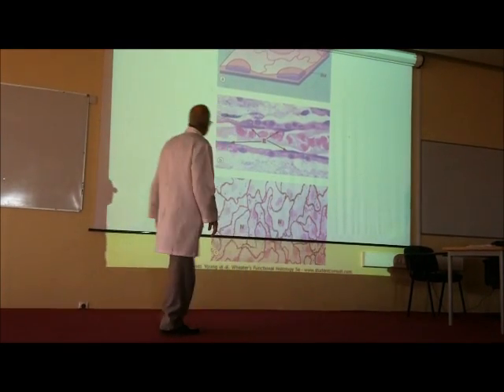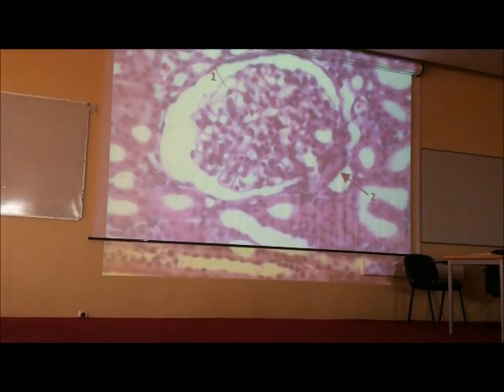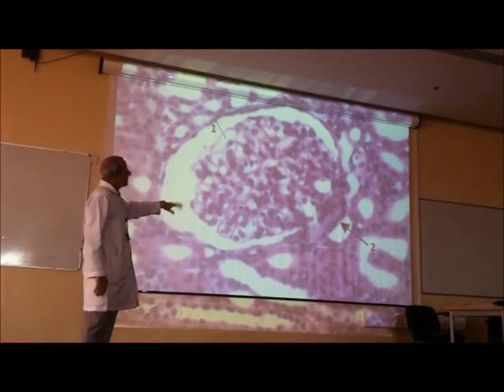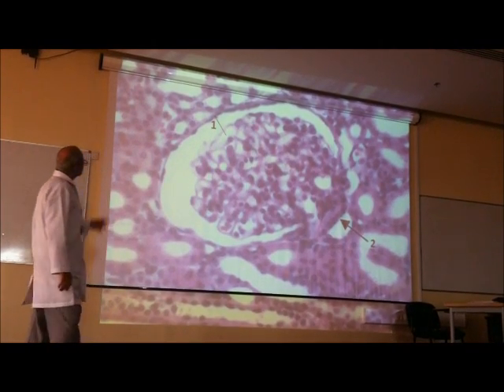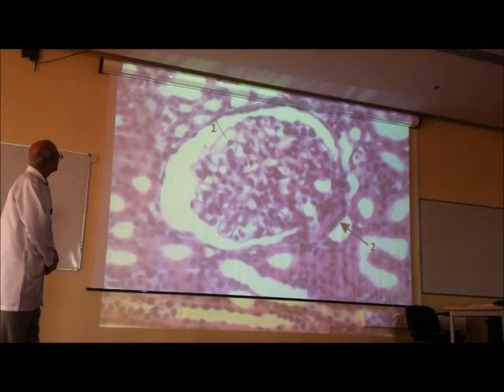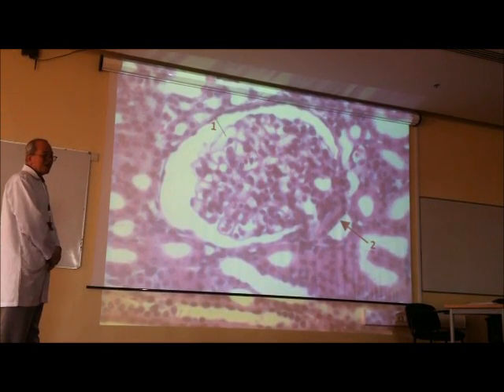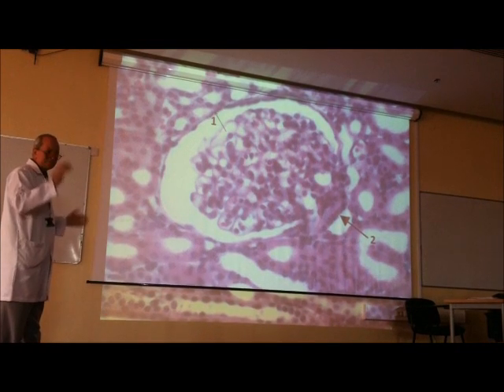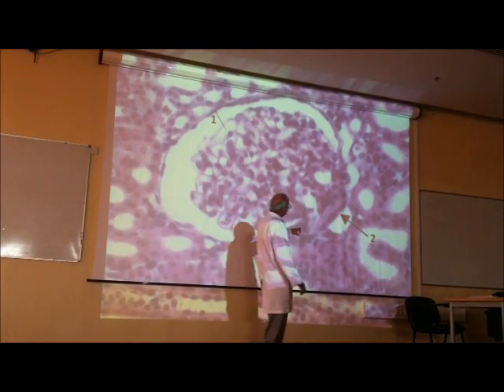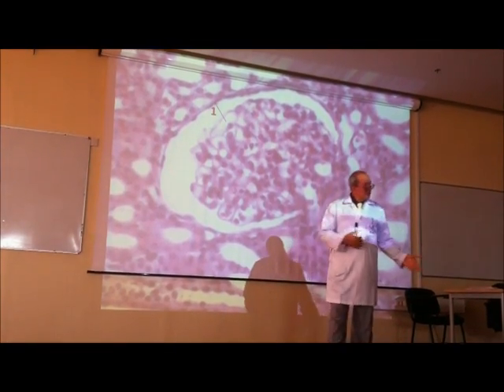Okay. So this is simple squamous epithelium. What else? So the exam may come just like this. What is number 1? Simple squamous. Okay. What is the shape of nuclei? What are the types of cell junctions in between epithelial cells? And so on. This is the second picture. What is the type of this epithelium? Simple cuboidal epithelium. Where can you find it?